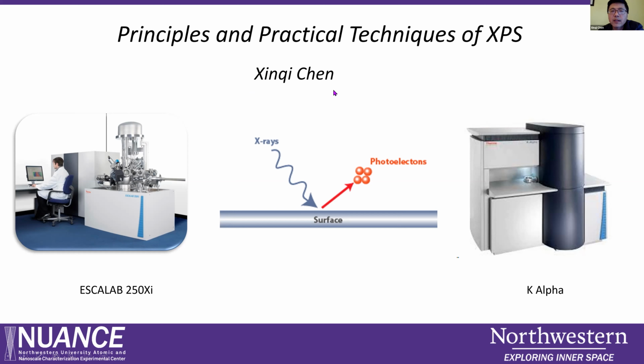Today's topic, I will talk about the principles and practical technique of XPS. XPS is quite a popular and very useful technique in our center. And I think more and more users are trying to learn this. Basically, I want to give the basics and the technique, and help you understand what XPS can do and cannot do.